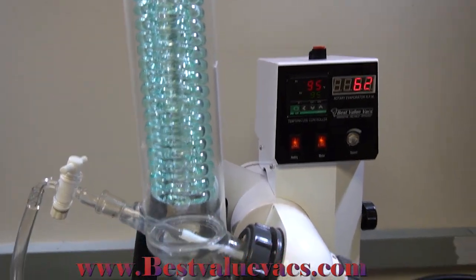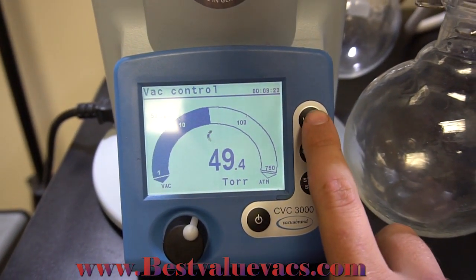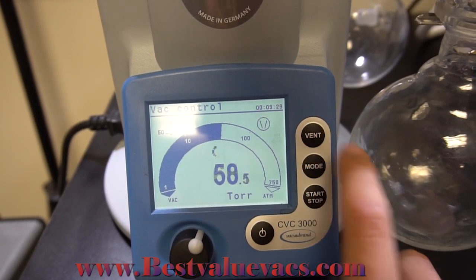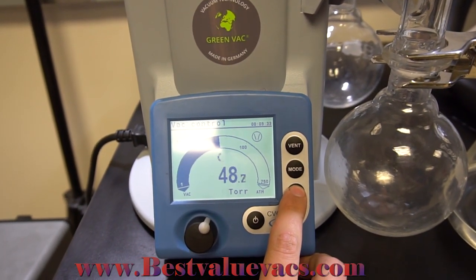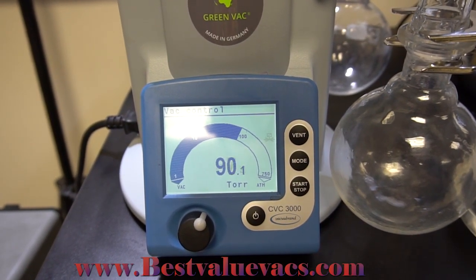If you look at our screen, you can see it has a very nice setup. There's a vent button — if you press it once or for a short time, it'll release a little bit of vacuum level. If we stop our program, it'll stop pulling the vacuum and release it. And if you hold the vent button until it beeps, it'll release complete vacuum.